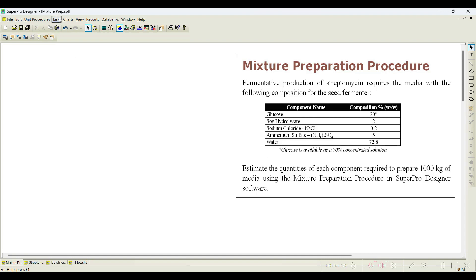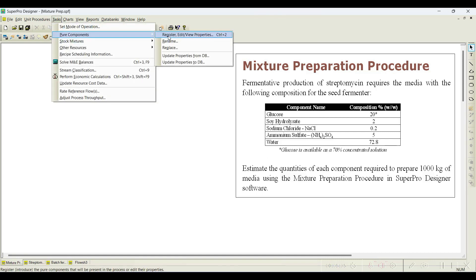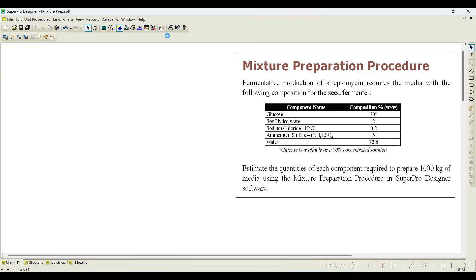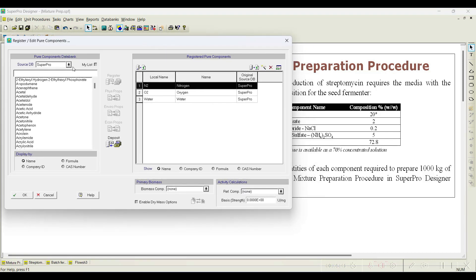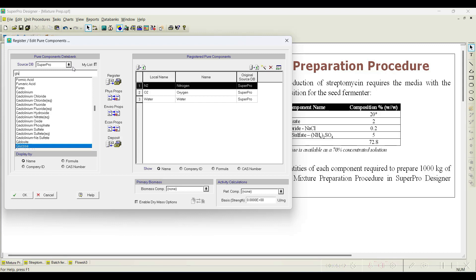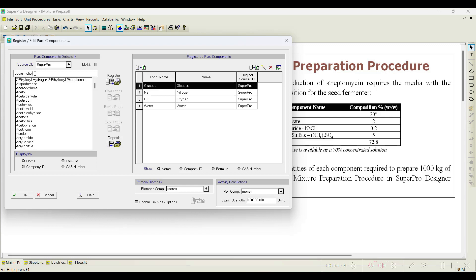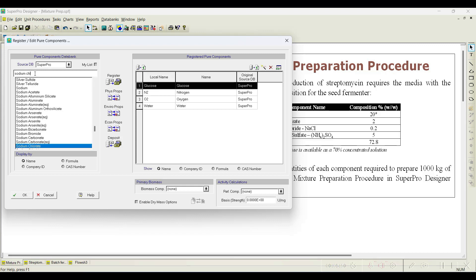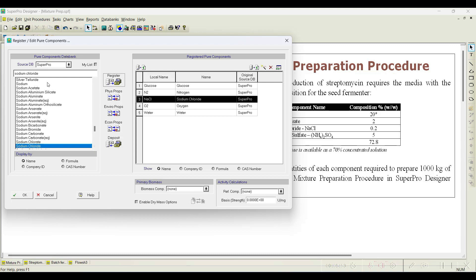Before starting the simulation, let us register the pure components. Go to Register and register all required pure components. The first one is glucose — it is available, so let us register it. Next is sodium chloride, and then we need ammonium sulfate.